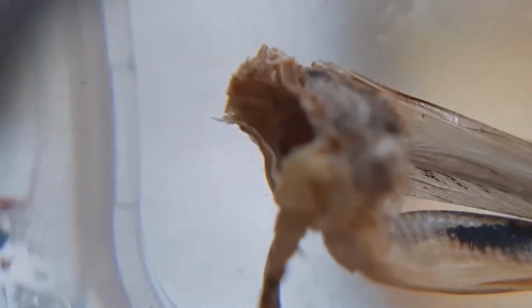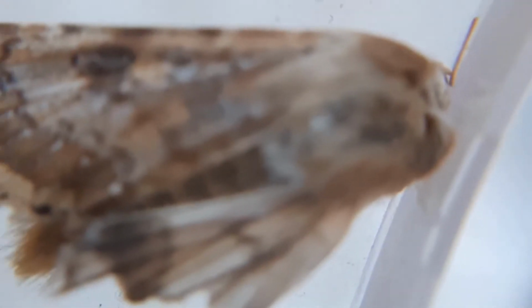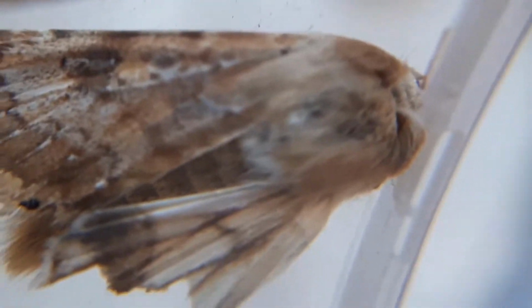Oh, it looks like a dragon, the mouth of a dragon. So this was the grasshopper, and beside it, this is the moth. This is the moth. It has the wings, and let's see if we can see its eyes. Yeah, here you are.